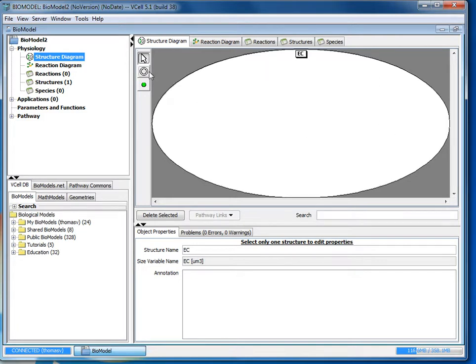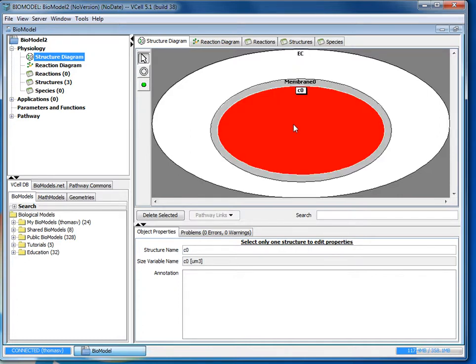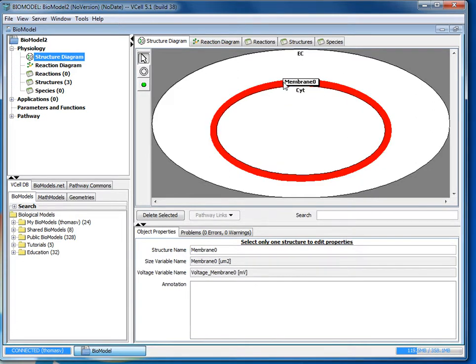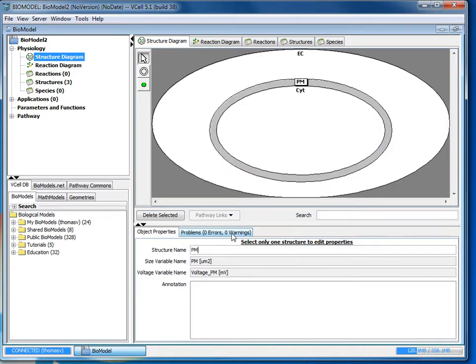Next we'll create the region for the actual cell by selecting the structure tool and clicking within EC. And with the red inner compartment selected we'll change the name to Cyt for cytosol. And then we will select the membrane and change its name to PM for plasma membrane.